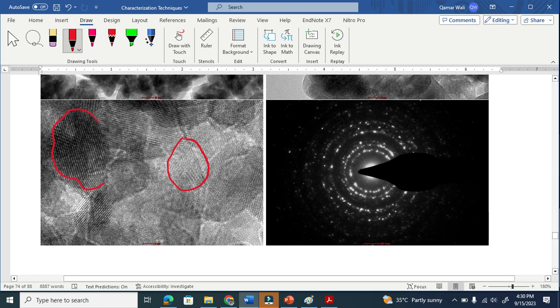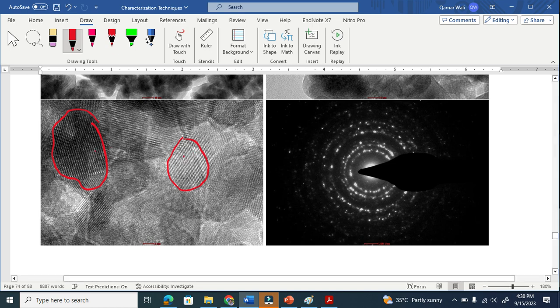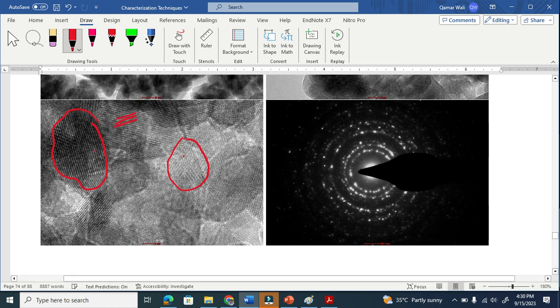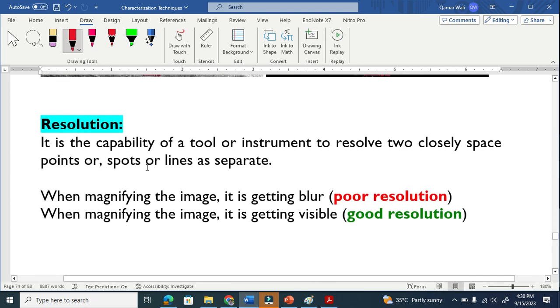When we further magnify, we get clear grains here. Now, resolution — resolution basically means we can see two grains as separate. You can see here one plane, another plane, another plane. I can see two planes as separate. Resolution is the capability of a tool or instrument to resolve — meaning to see two closely spaced points, spots, or lines as separate.